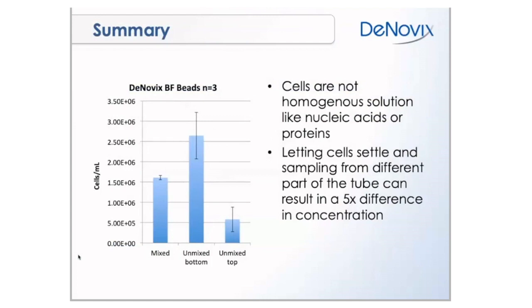So, this is one of those things that might seem obvious to people, but I think that a lot of times it can have more of an effect than might be realized, to make sure that you're really mixing well and loading your cells onto the hemocytometer right away after the mix is done and not getting distracted.